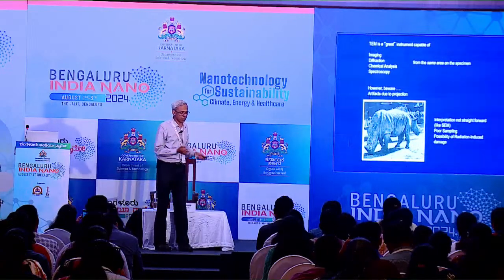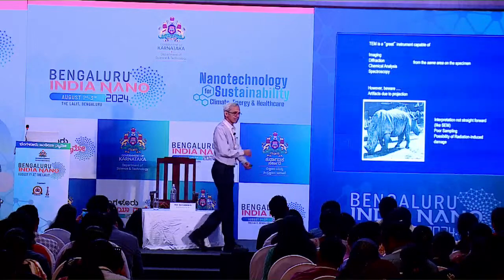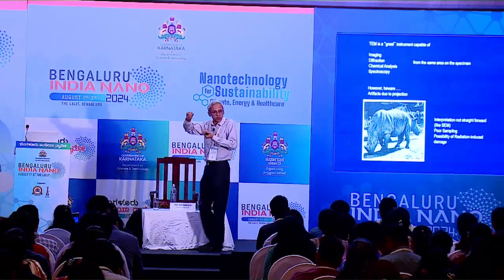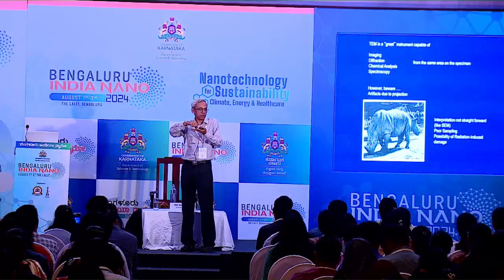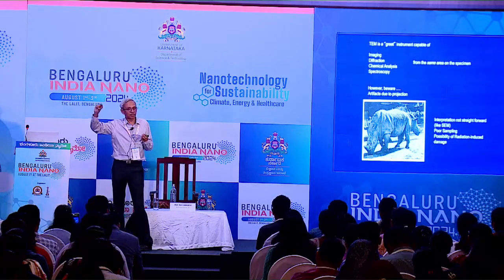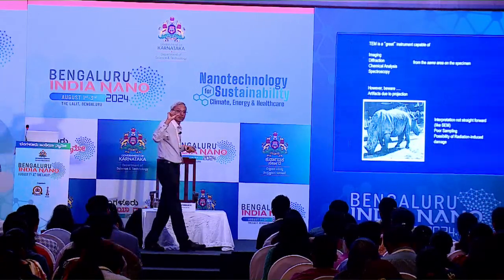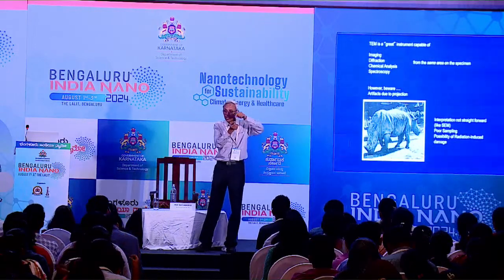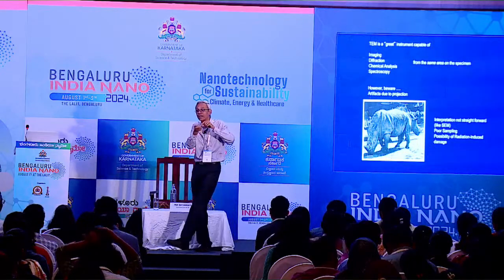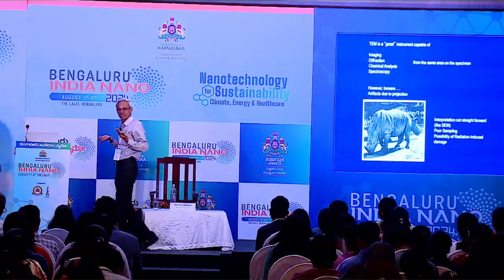So that's a very good thing because we can get crystallographic information. The third thing we can do is chemical analysis. One of the things that your electron beam does is that when it falls on the material, it knocks off inner electrons, which means that electrons from the outer orbit will come down. I'm using this very loosely, which means that the difference in energy will be emitted as an X-ray photon. These X-ray photons have characteristic energies depending on what the delta E is, right? And therefore, you can use them to find out what elements are present in the material. This is your EDS or X-ray analysis that you have in the TEM.